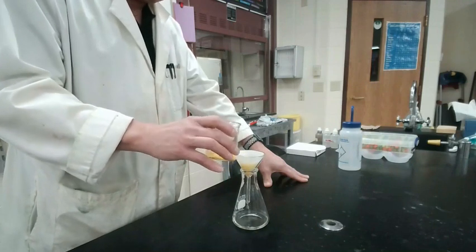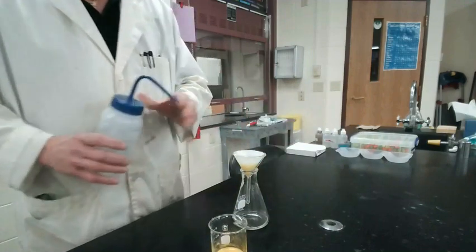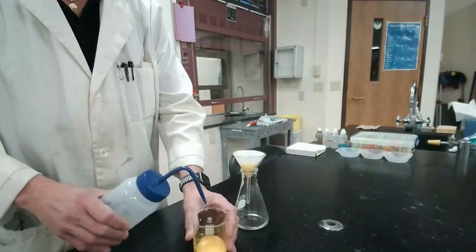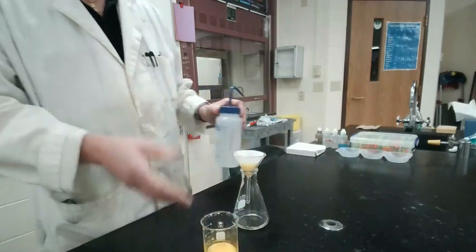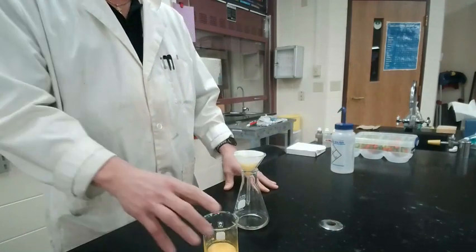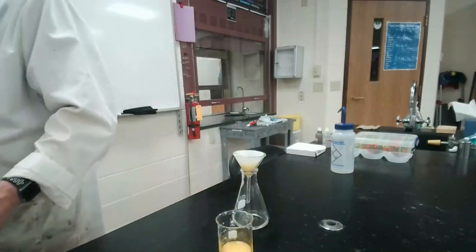When I see the solid start to move toward the edge, I tip it back up. Filter paper is going to catch the water. Our filter paper is going to catch the solid. The water and the sodium nitrate is going to drip on through. And I rinse this down one more time, and that'll be my final rinse.